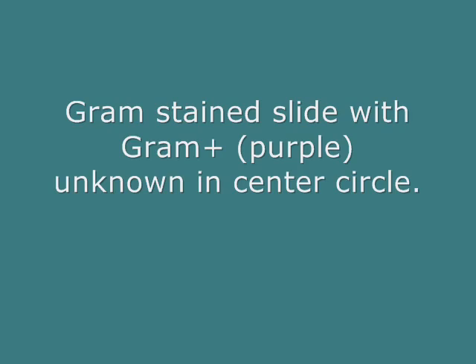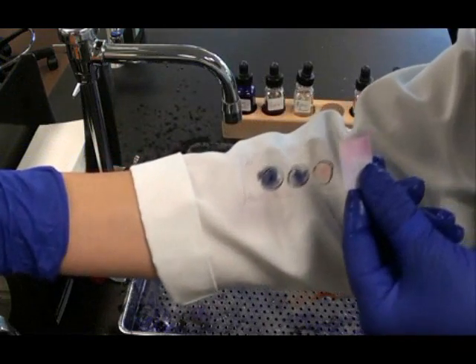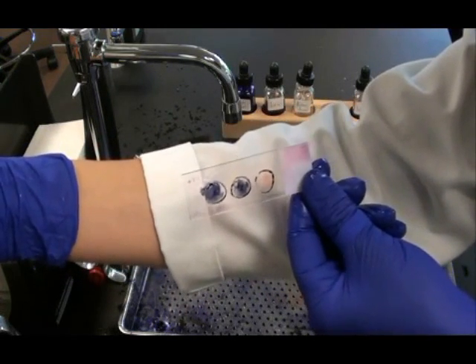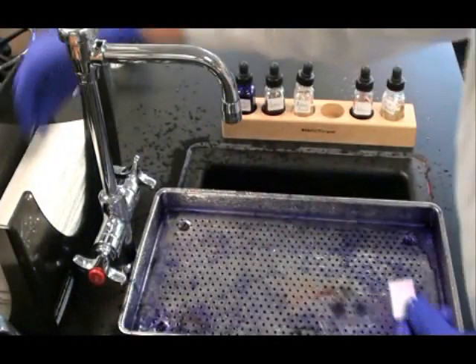I'd also like to show you an example of another slide that I prepared with a Gram positive unknown. You see my positive control on the left. My negative control on the right. And this unknown is purple like the positive control.